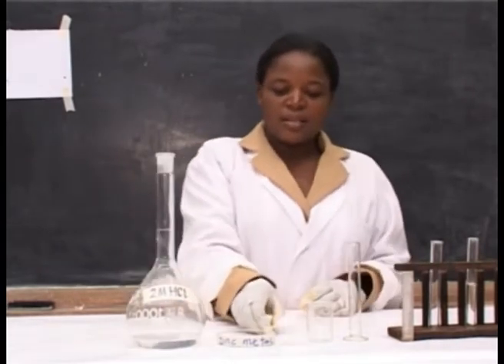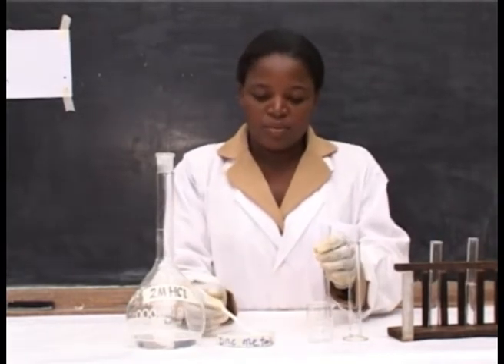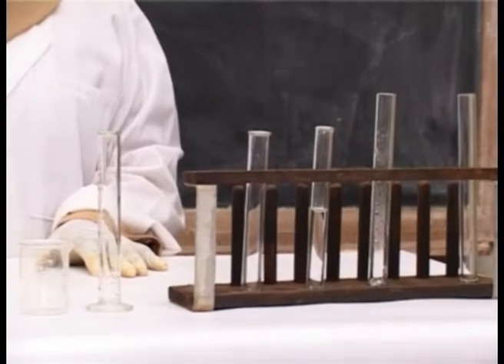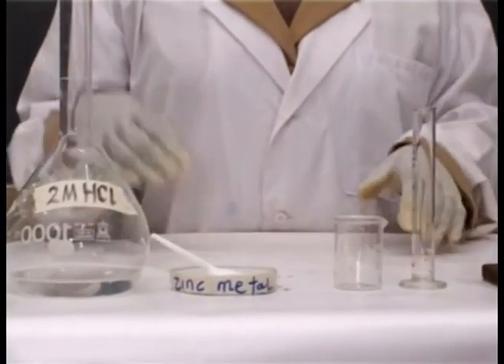Take zinc granules and put them in a test tube. Measure about 3 ml of hydrochloric acid.